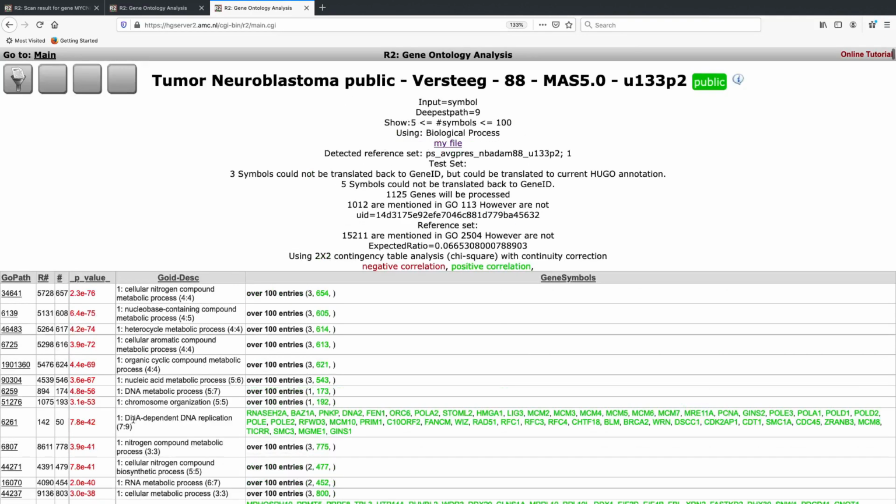biological processes. We will discuss more details on the gene ontology analyses within the gene ontology analysis section of differential gene expression. So in the example we've looked at here, we've looked at how all genes in a specific data set correlate with your specific gene of interest. However, you may want to do more specified analyses.